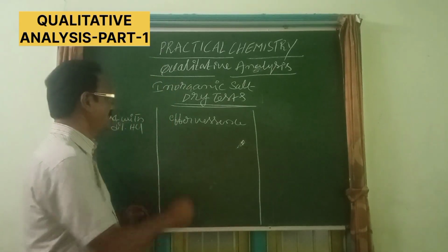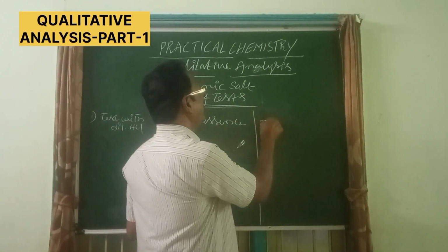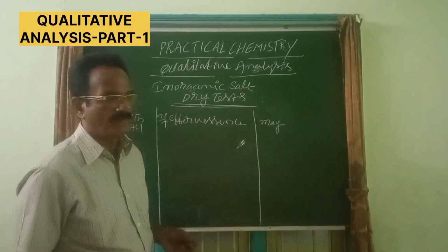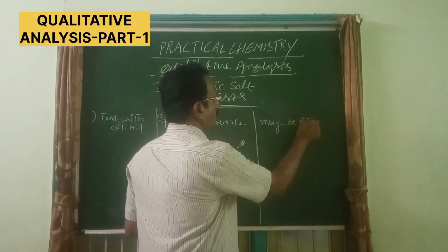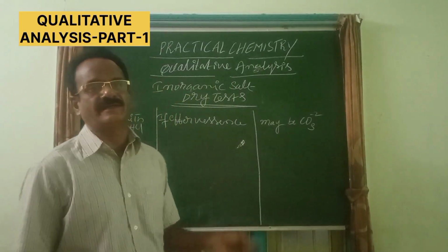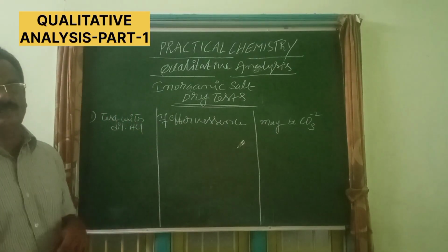Effervescence observed. Okay, if effervescence is there, then, all these tests are useful for identification only, maybe carbonate. That particular salt may contain carbonate when effervescence is observed during addition of dilute HCl to the salt.